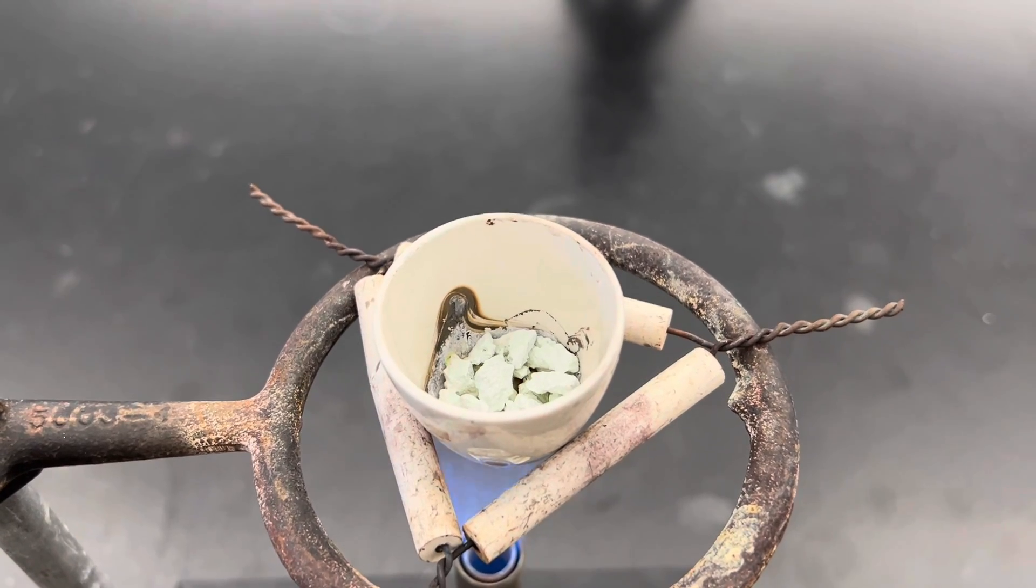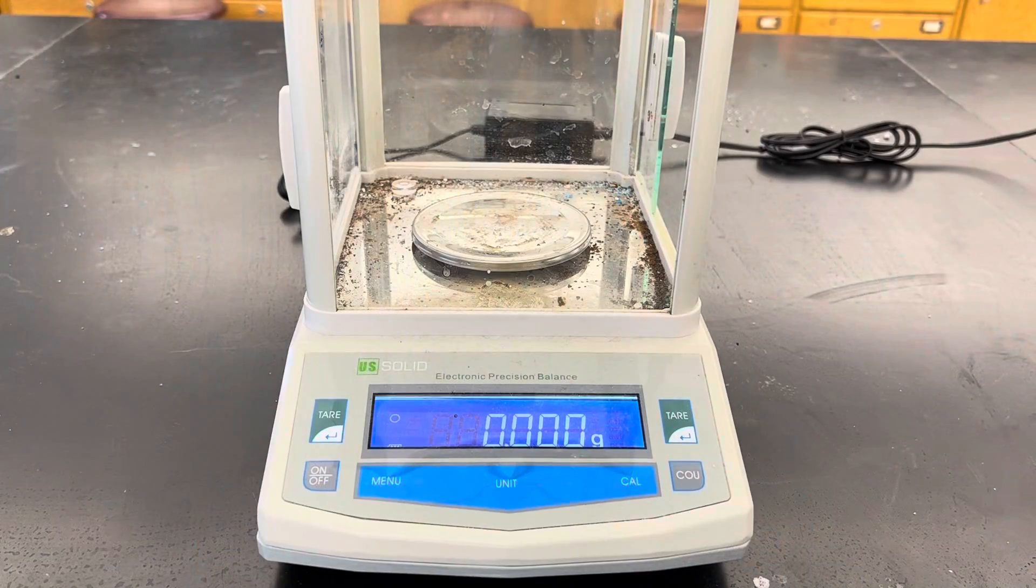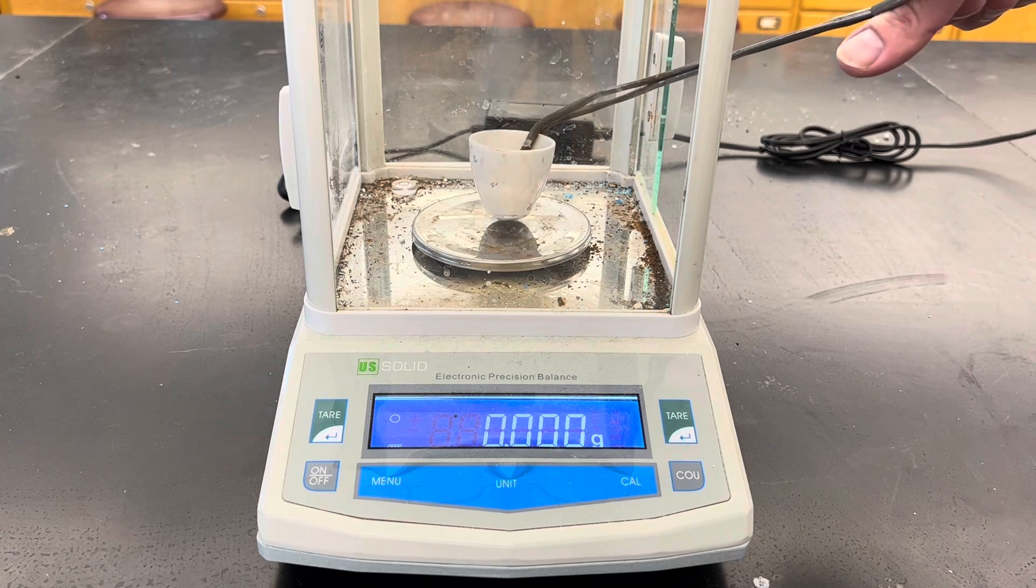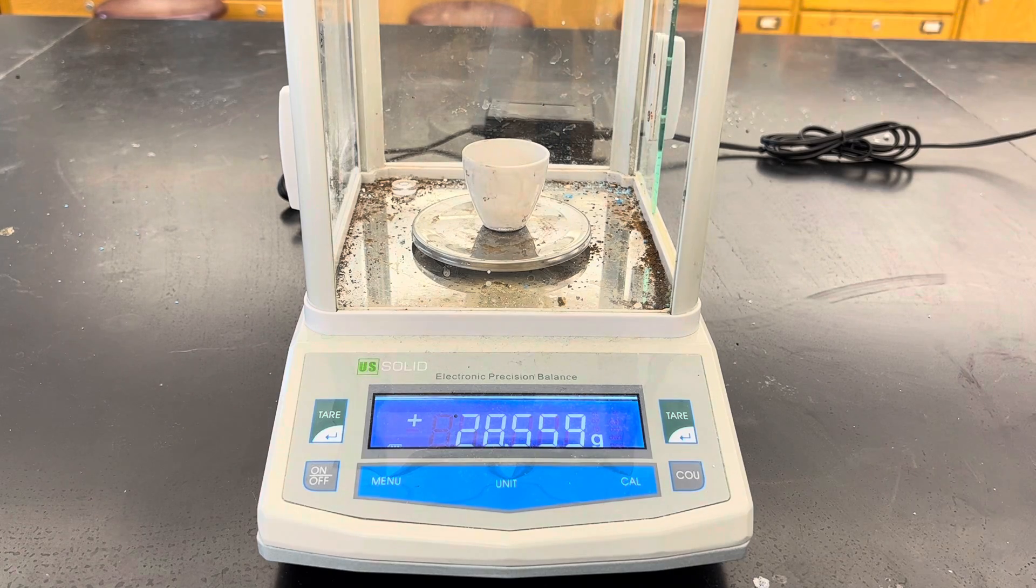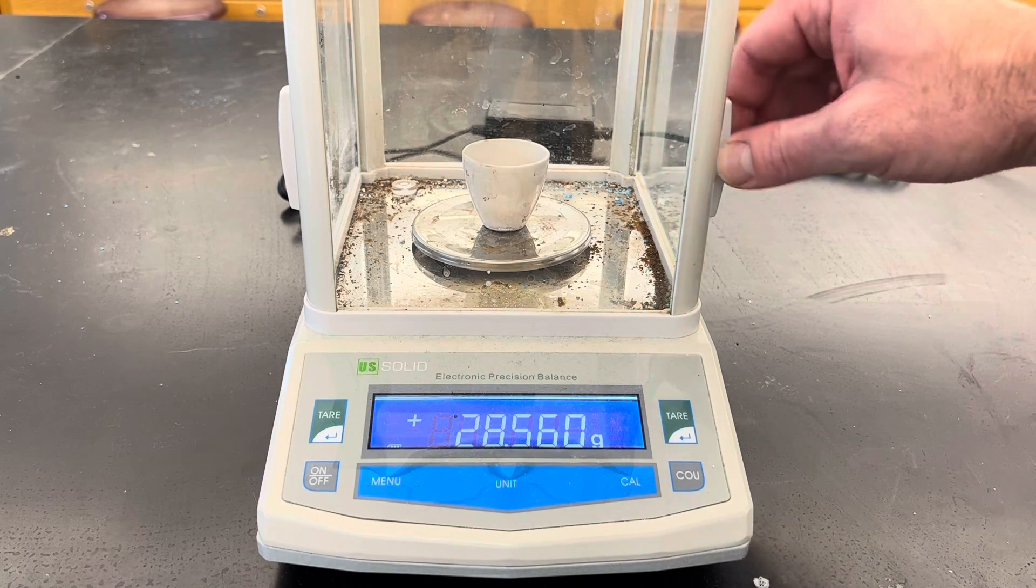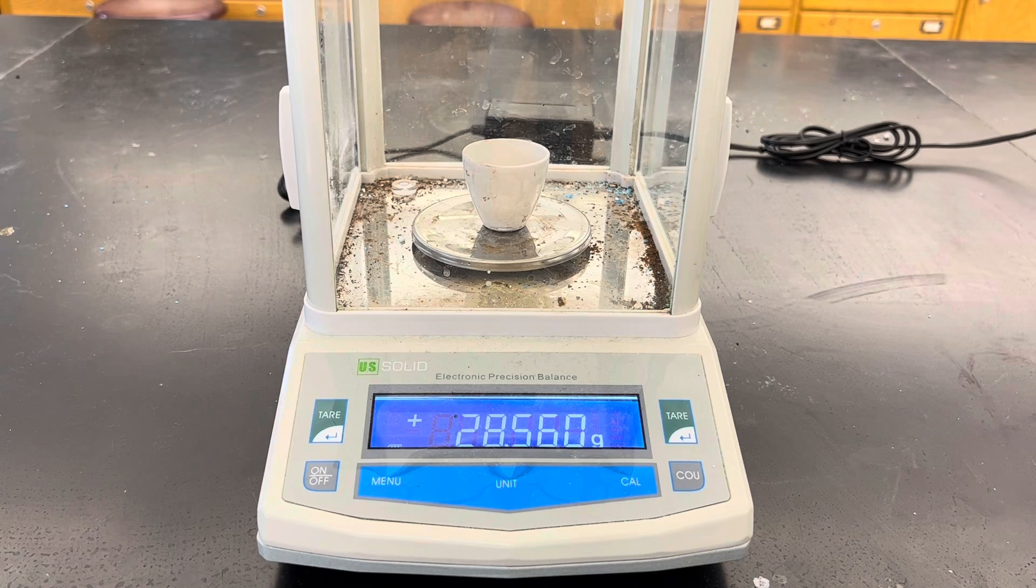Now after it's cooled, we'll check the mass of the crucible and the anhydrous compound, which is coming out to be 28.560.